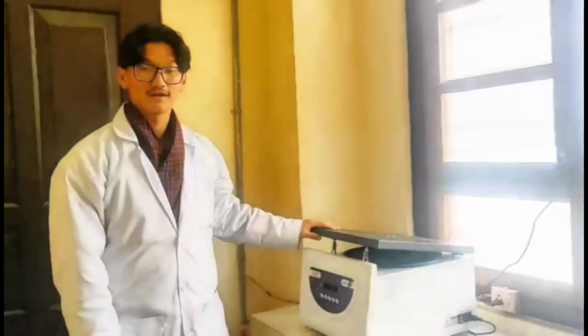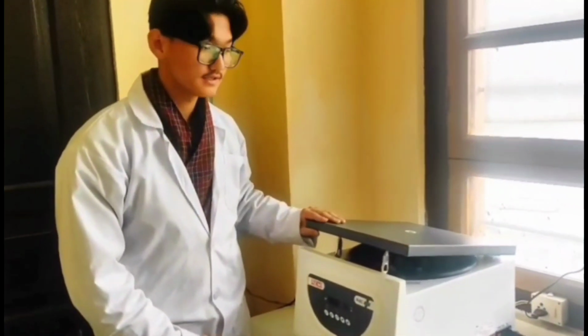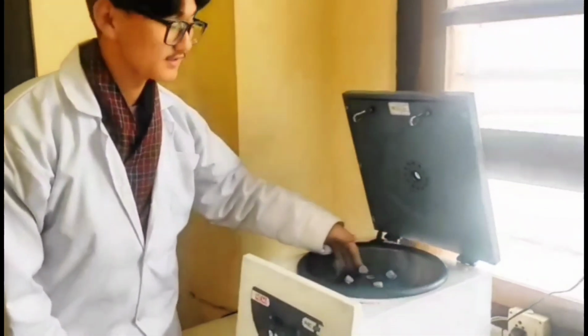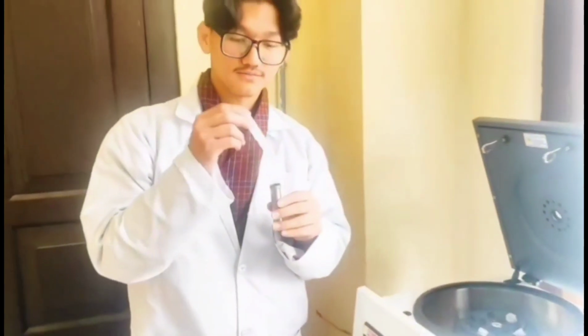So, hello everyone. Today we're going to talk about how centrifugation works. As you can see, the centrifuge is composed of many components. If you come closer, this one at the top is known as the lid. When we open the lid, we can see the rotor inside. Now this rotor holds the test tube bucket, which holds the test tube.